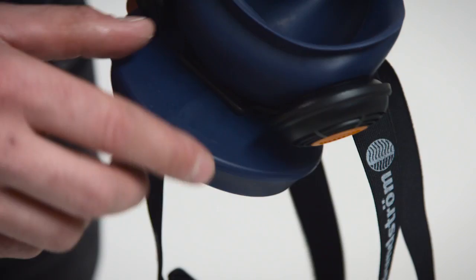Inspection before use. Check that the mask is the correct size. Check that the mask is complete, correctly assembled and thoroughly cleaned.